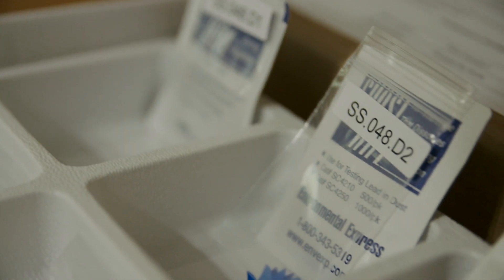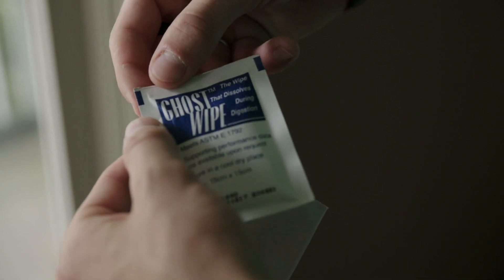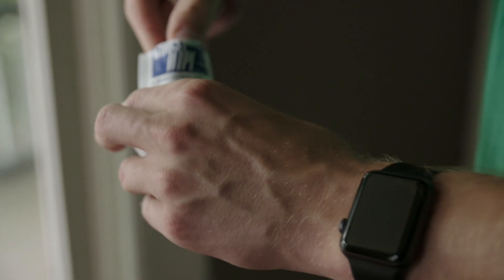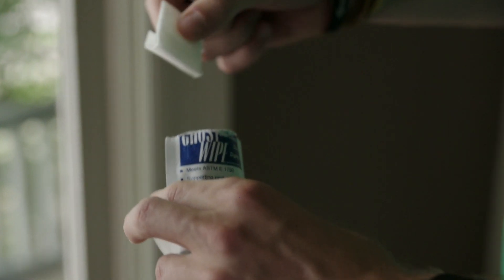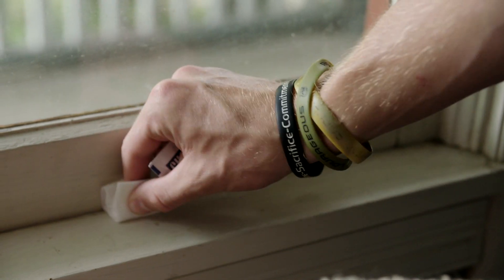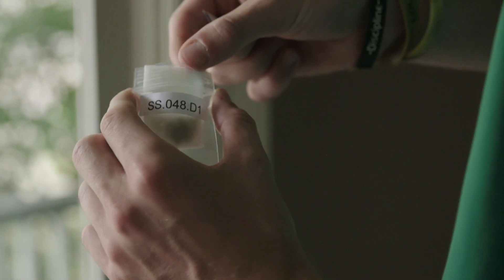To test the house dust, find three wet wipes in three small bags. Take a wet wipe out of the package, but don't unfold it. Our test works best when all of the dust is collected in one small location on the wipe. You're going to collect house dust on the side of the folded wipe and then slide it back into the bag.